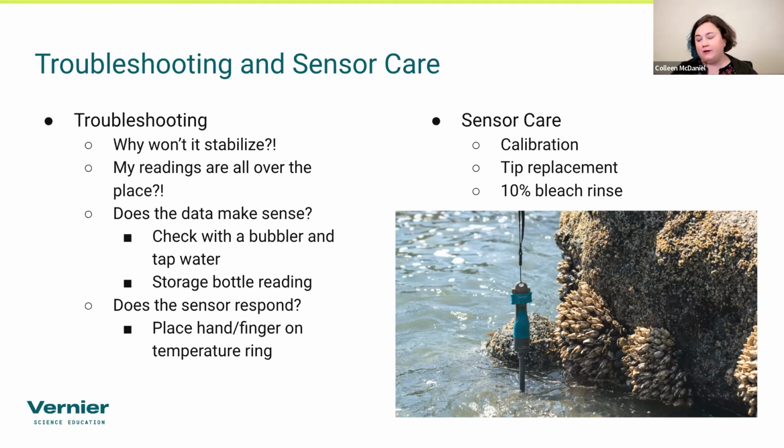That's a good indicator. With the optical probes, the tip is warranted for 1 year. It's going to last longer than 1 year unless you take that probe tip and scrape it along rocks at the bottom of a stream or in the ocean or things like that.